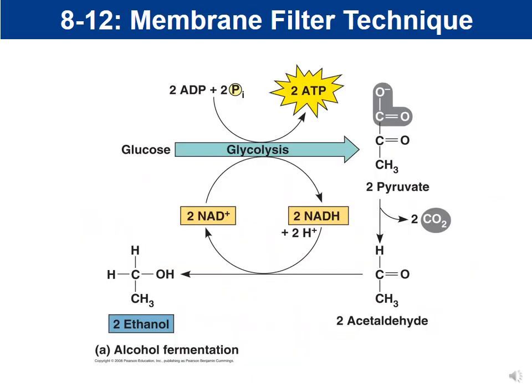So basically, this is just showing you kind of how the sodium sulfite works. So lactose is a disaccharide. It gets metabolized. It gets broken down into glucose plus galactose. The glucose can go through glycolysis. So it's going to break that 6-carbon sugar in half to 2 3-carbon pyruvates.